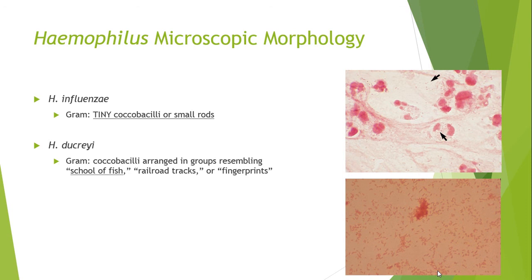Don't say intracellular gram-negative coccobacilli. Why is that? The doctor's going to think of gonorrhea, right? So I just leave intracellular out of the question. I don't know if it's laying on top of the white cell or if it's inside. I can't tell, so I leave it out, just to be safe.